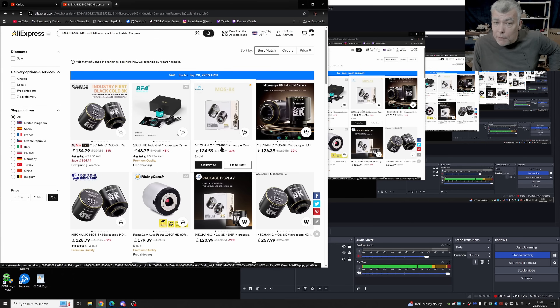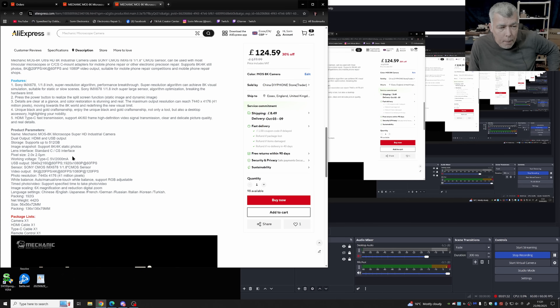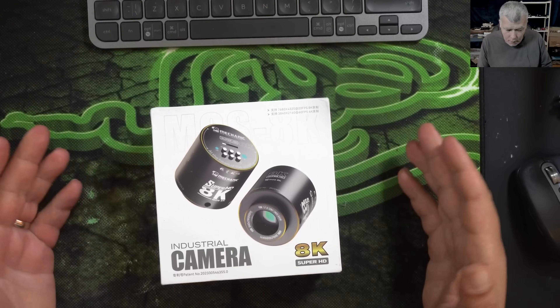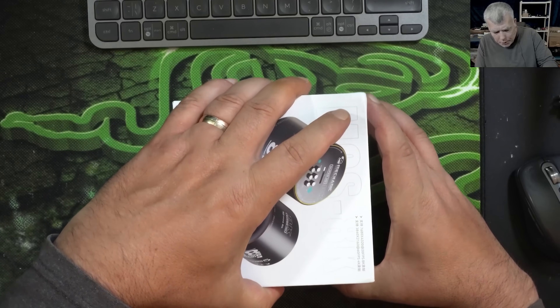They claim it's 8K at 20fps and 4K at 60fps. We're looking at the 4K mode for the 60fps, though 8K at 20fps is decent if you need the resolution. The camera comes with a new Sony sensor, so I'm really curious whether we should switch to this camera. Let's try to compare it with my current one and see if it's genuinely good for 125 pounds — it seems too good to be true, but let's test it.